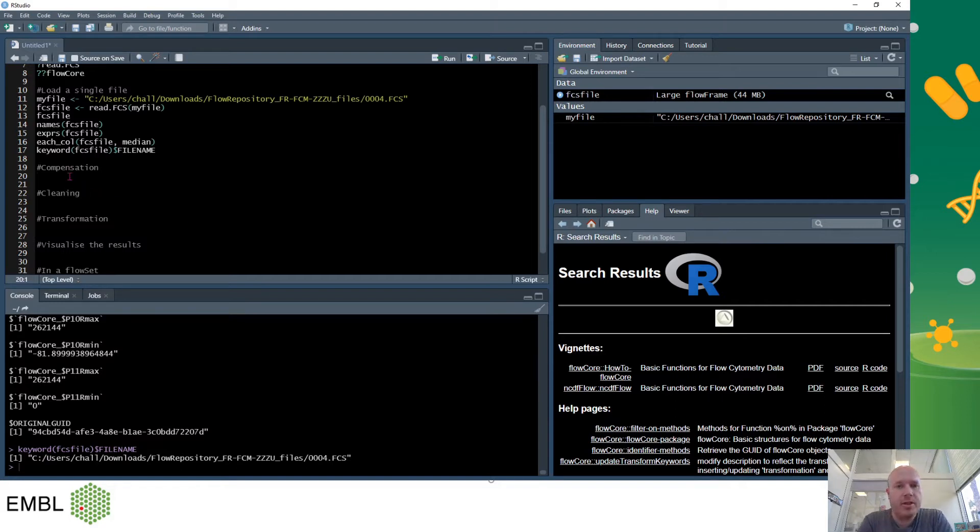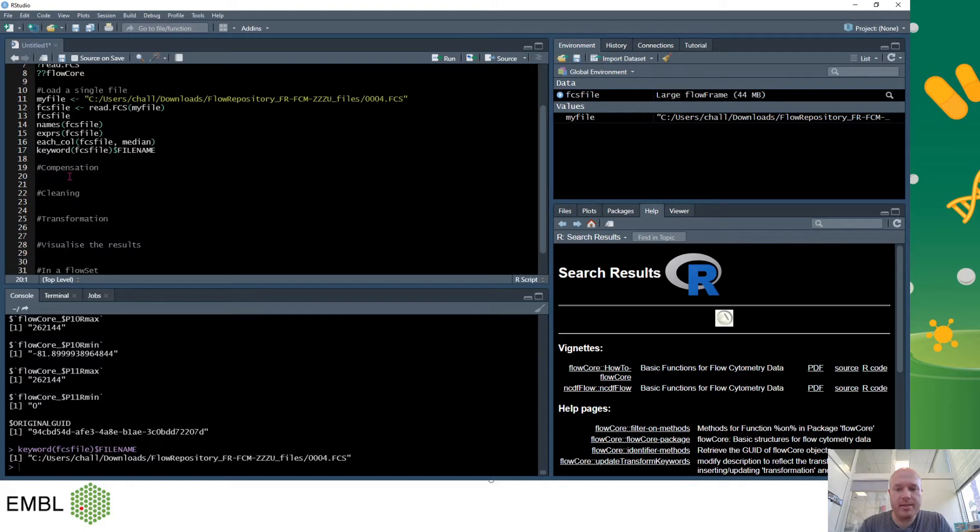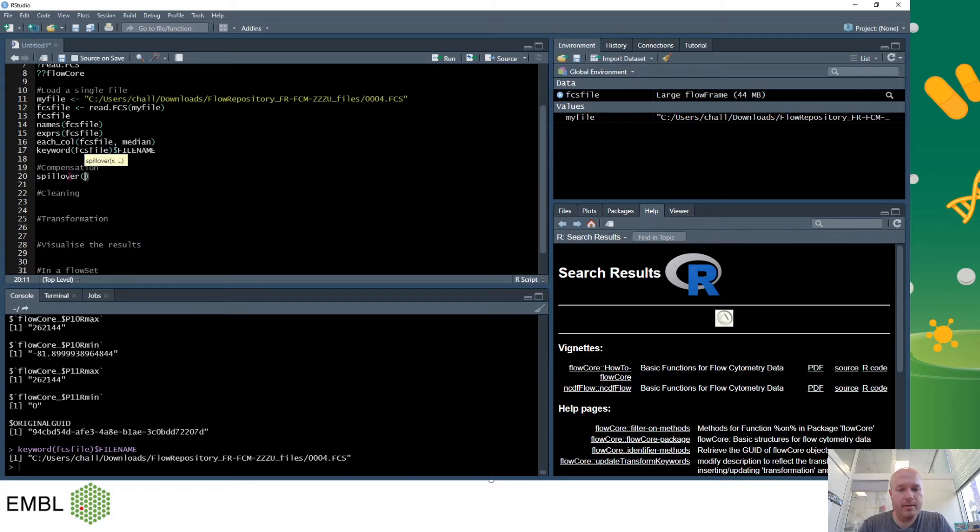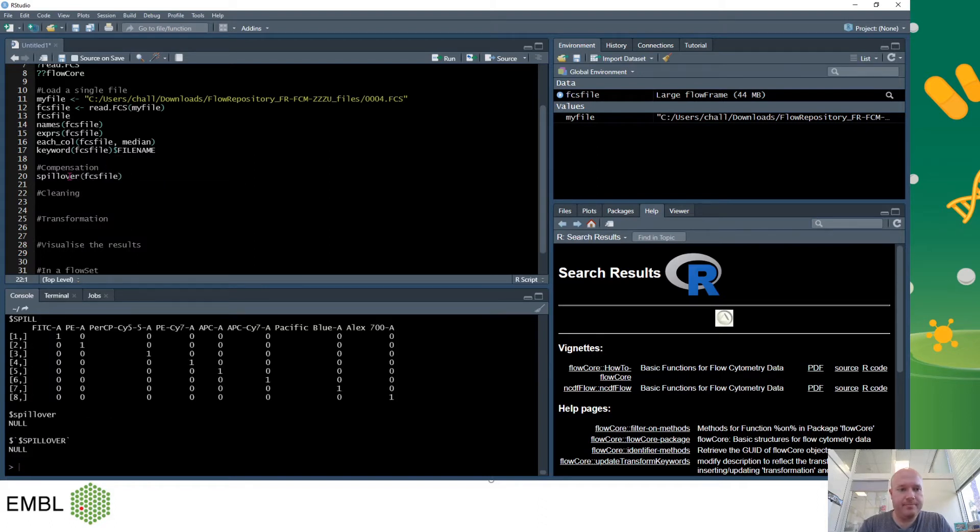So next we'll look at compensation. Each FCS file normally contains the compensation data from when you acquired it. If not, FloCo can do the compensation manually but here we will assume that it's inside the FCS file itself. To find out where it is you can type in spillover.